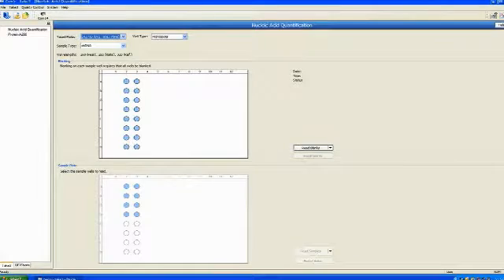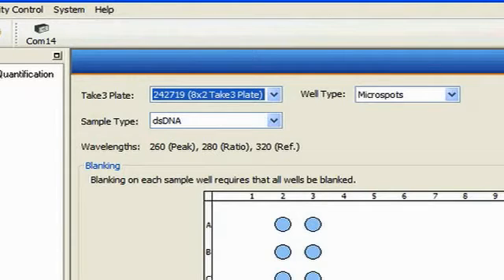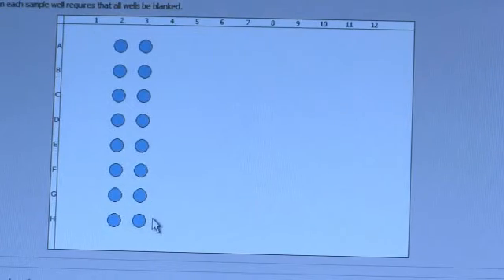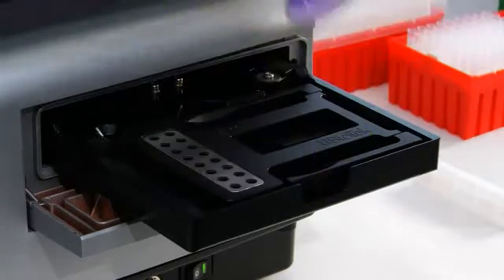Open a Take 3 session in Gen 5 and select the sample type, either single or double-stranded DNA. We're using double-stranded DNA samples, each with their own buffer blank, so all microspots will contain blanks.